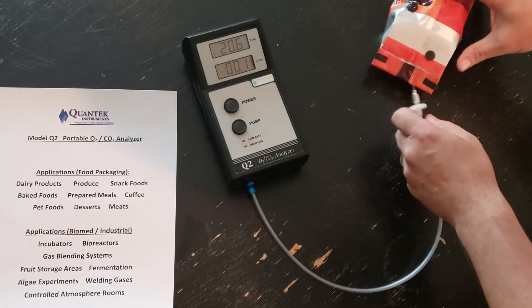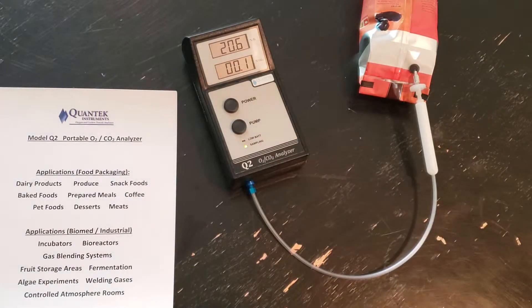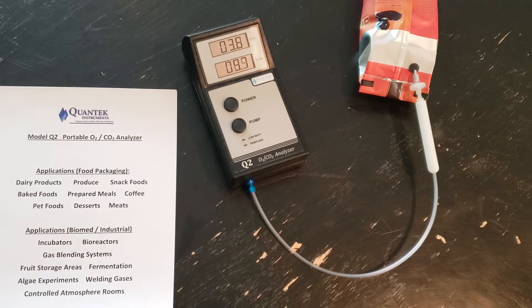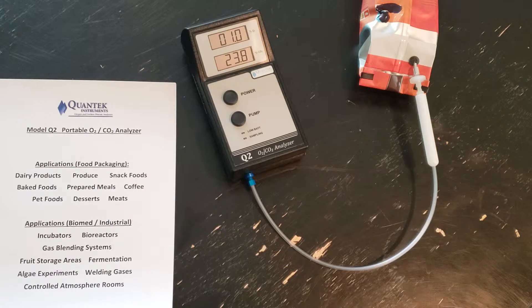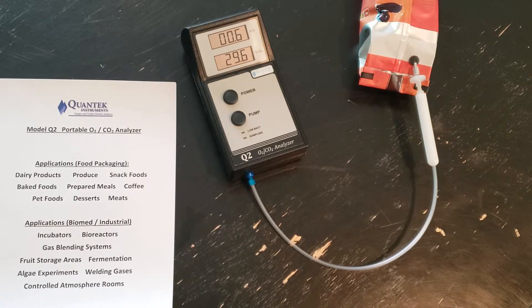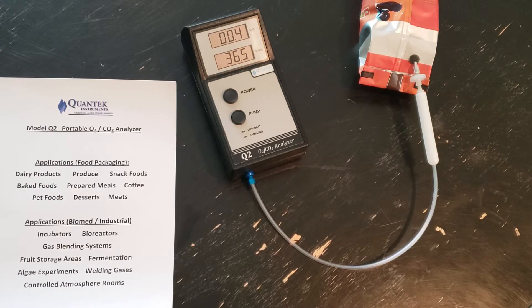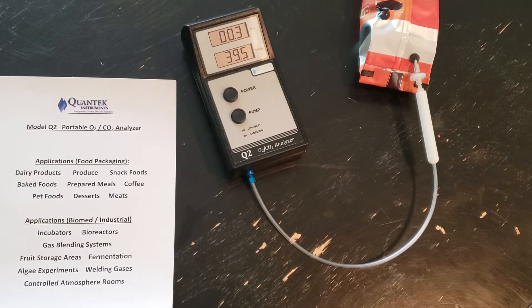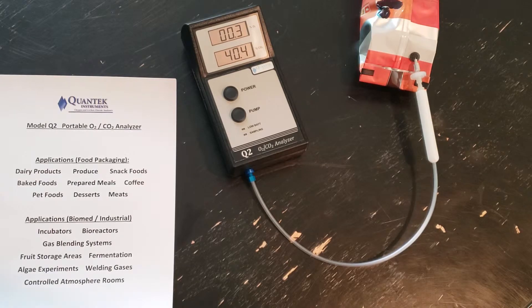Now we're going to test a package of ground coffee, which we would expect to be low in oxygen. The CO2 can vary somewhat with coffee packages. This is ground coffee — it does have an off-gassing valve. I'm not sure if it has an oxygen scavenger in the package, but typically with coffee you'll see higher CO2 and again low oxygen. The CO2 takes a little bit longer to get a reading but will stabilize — about 0.3% oxygen and 40.4% CO2.